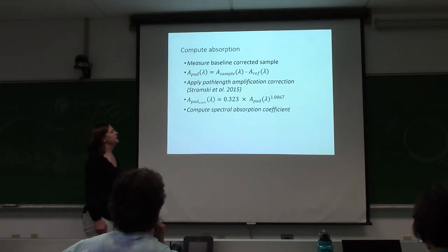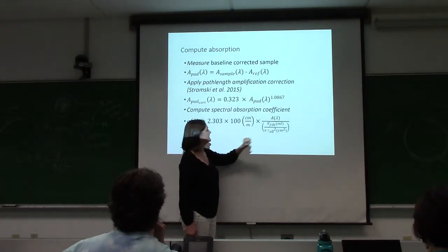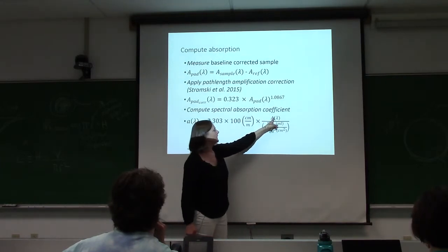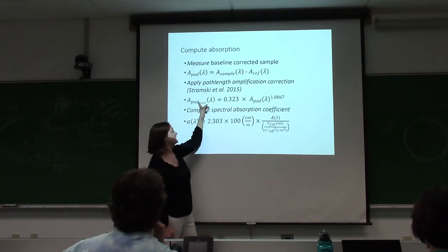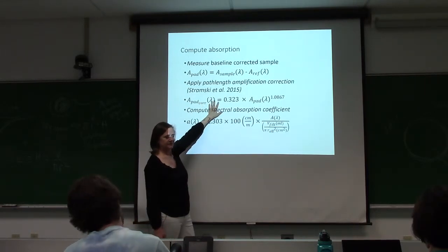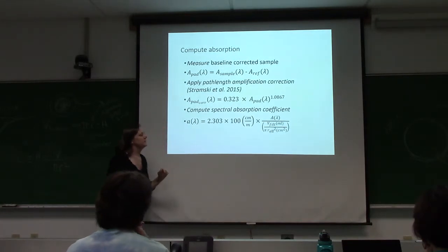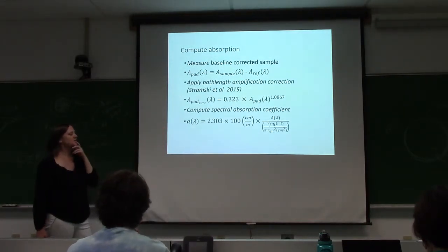And then we compute the spectral absorption coefficient using this equation, where the absorbance is this. I've written this all down. You don't have to worry about this. And so that allows us to measure the absorption, or calculate the absorption from filter pads.